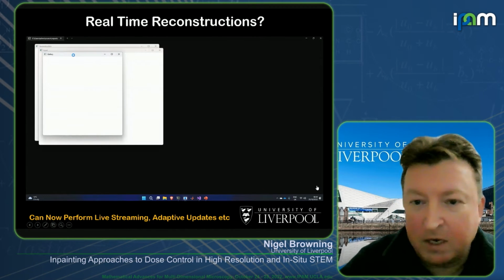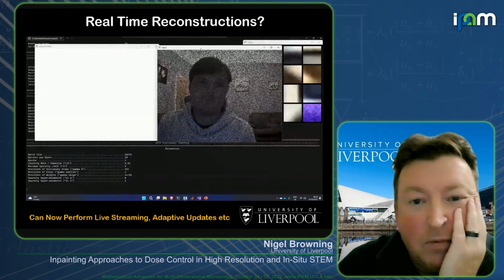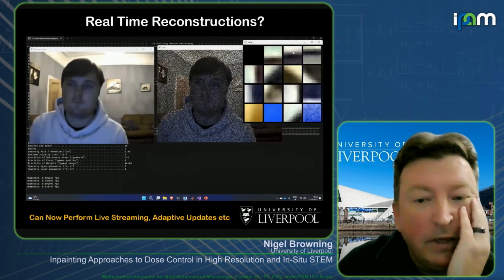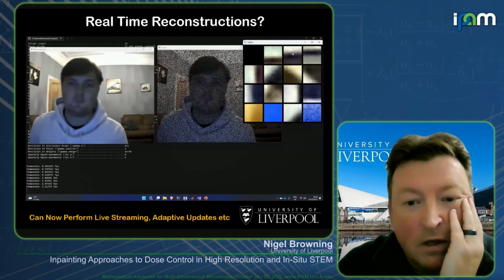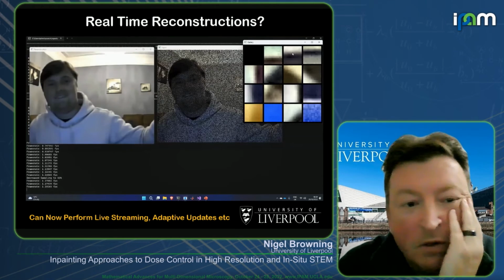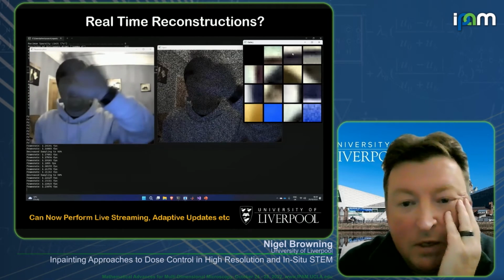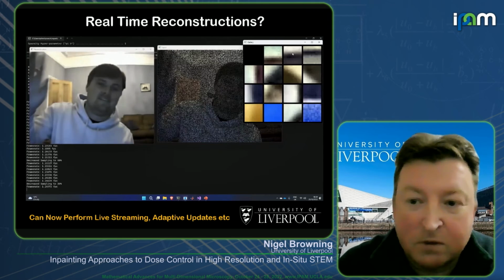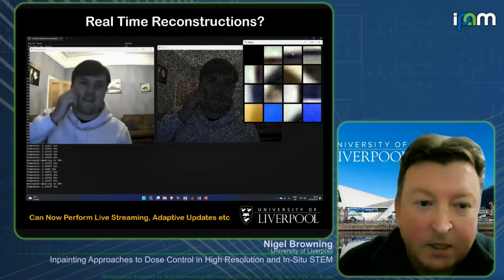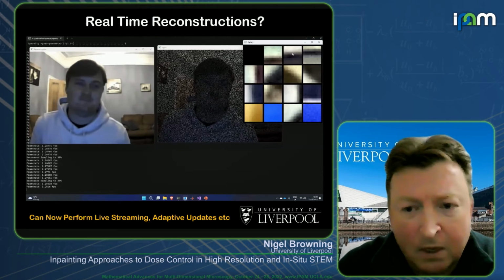But this is just running BPFA, the same webcam, now in real time, shows the dictionary, shows the BPFA approach, shows the reconstruction that we can get out of it. So it's again going down to lower and lower sampling rates. But because it's BPFA and we have more and more images as we go, the reconstruction actually gets quicker as you go in time. So as you go to smaller and smaller sampling, as you go to more and more frames that you have to make your dictionary, your reconstruction actually gets quicker and quicker the more you go. So we can now get down to about 1% of the pixels and get the reconstruction to work pretty well.